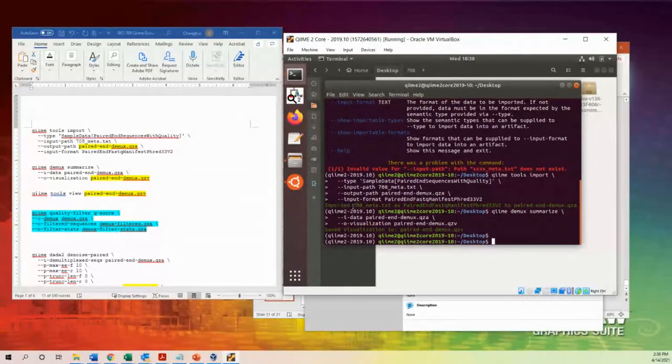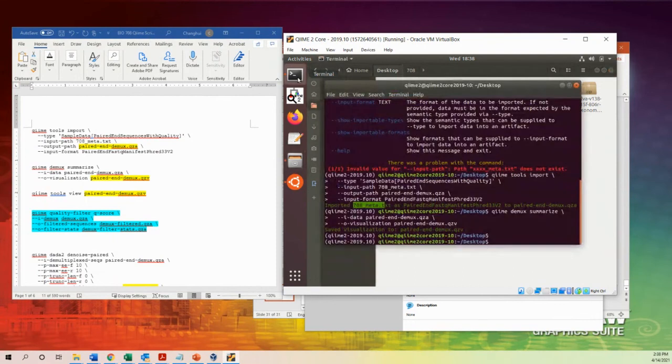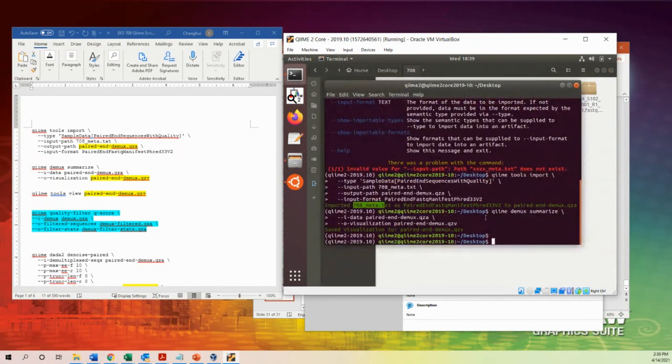So they say they have a problem to import this. Yes, I have the same file as you do. I have this file, this file. Then the problem would be here. Okay. Does this file look the same as mine? No, I think you haven't unzipped those files, but I have unzipped and then dragged them and copied them. Should I then put the zipped ones? Yeah, okay. You go back one step and then put it back here again. Okay.